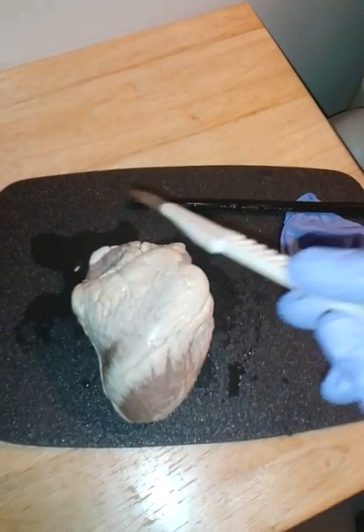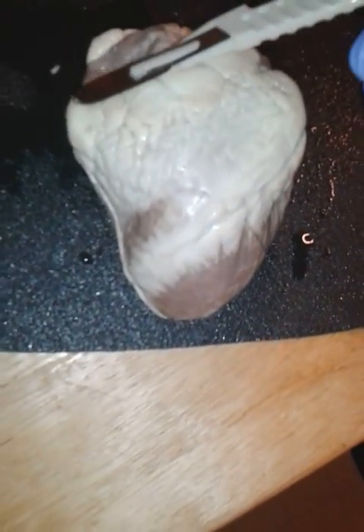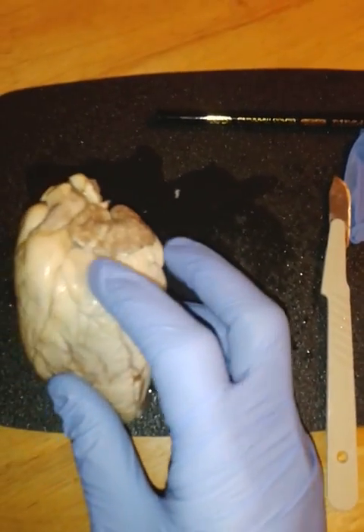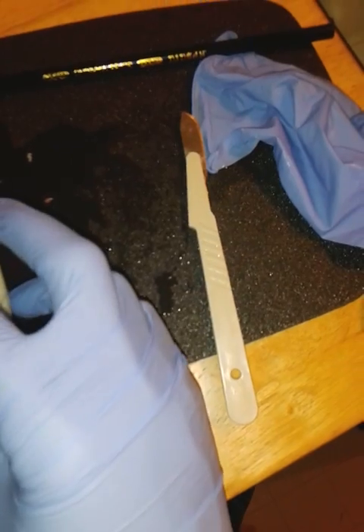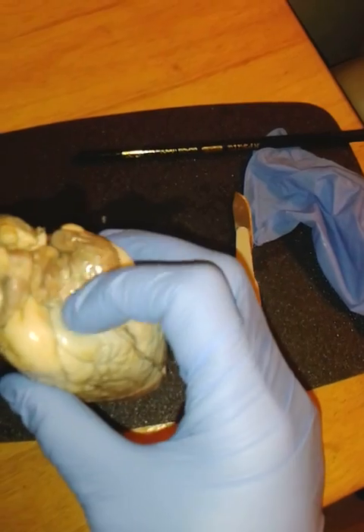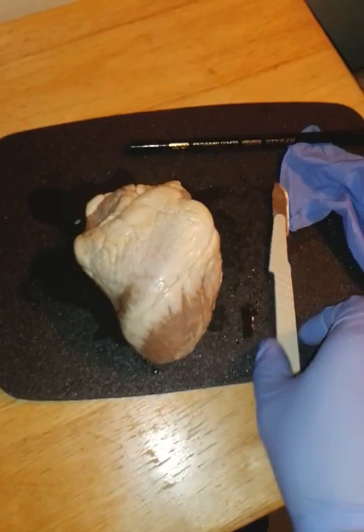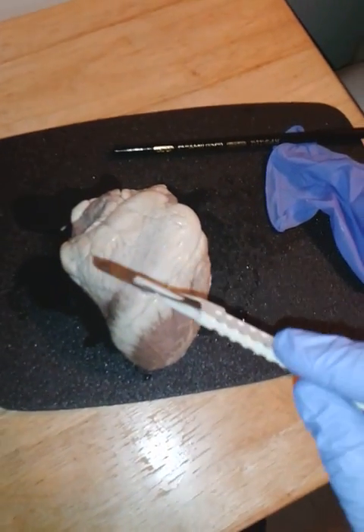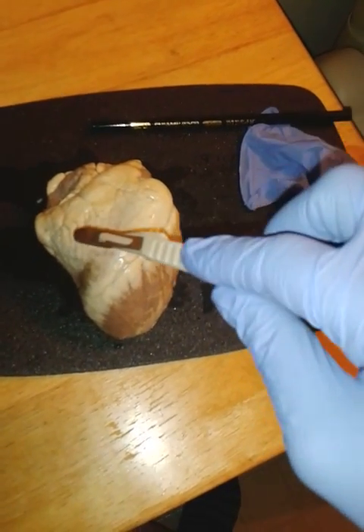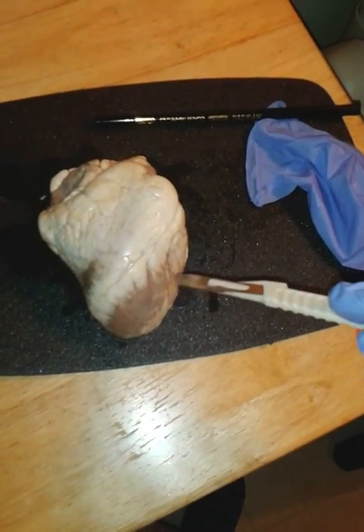Okay, and the right auricle is right up here, the kind of flappage that covers over that space, and the left auricle would be right here. The other, actually. Yeah, right here. Okay. And the right and left ventricles, I think we reviewed, would be inferior to the atria. So right ventricle here, left ventricle here.